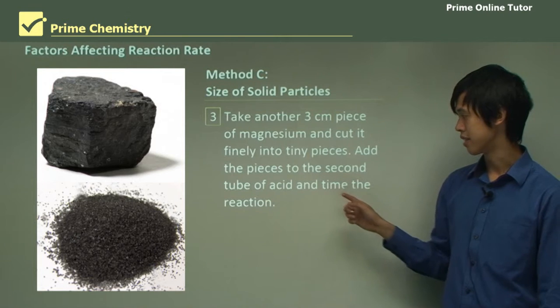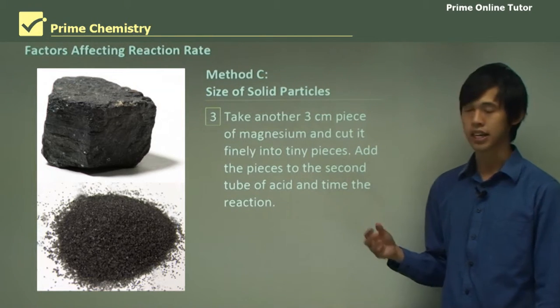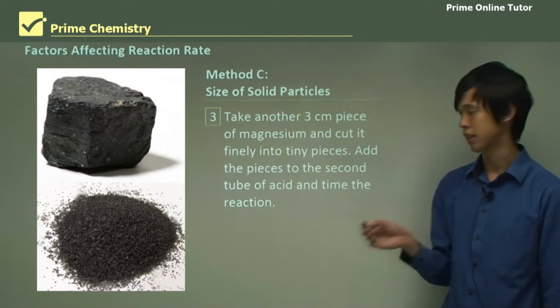And add the pieces to the second test tube of acid and time the reaction, okay? So you're going to see how long it takes for the tiny pieces to react compared to the big lump, okay?